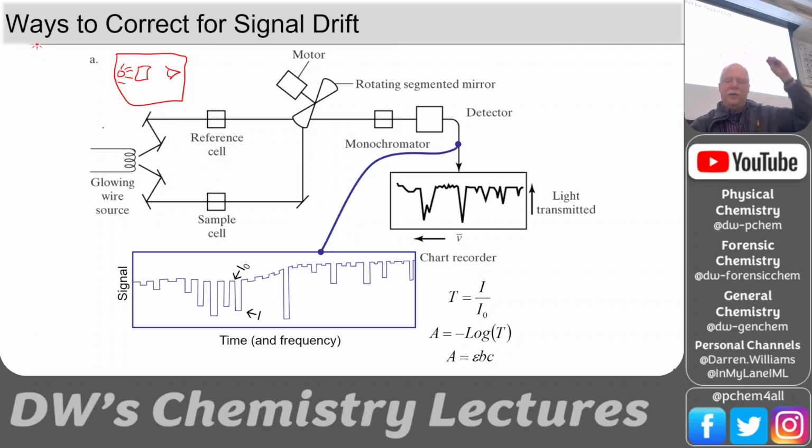And so you put the blank in there. Say if you're doing copper sulfate, you put water in the cuvette, and you adjust the little needle so it says 100% transmittance, or let's say 0% absorbance. We'll do that, and then you take the cuvette out and you put your sample in. But at the same time you put the sample in, some kind of power surge happens, or the elevator's running or whatever, and so the light gets dimmer, not from the sample, but because of the electricity. And so it drifts. And so this is drift.